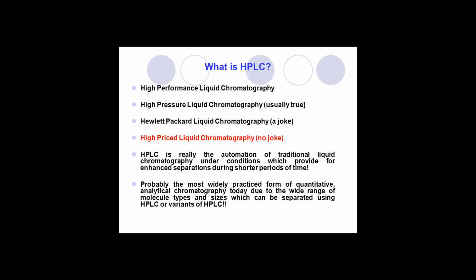HILIC bonded phases have the advantage of separating acidic, basic and neutral solutes in a single chromatographic run. The polar analytes diffuse into a stationary water layer associated with the polar stationary phase, and are thus retained. The stronger the interactions between the polar analyte and the polar stationary phase, relative to the mobile phase, the longer the elution time.